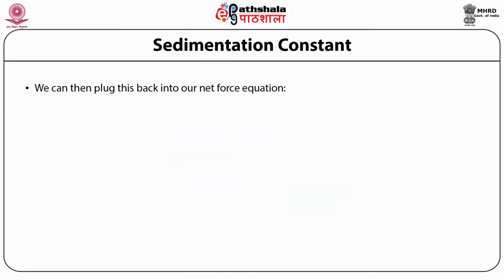So as we derive this equation further, we can see that this depends upon the partial specific volume and many other parameters.